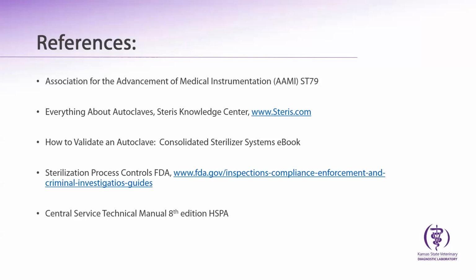And if you're doing glassware where you're just covering it with foil and using one of these, basically bending it over to hook on there, and then putting your foil on top with a piece of autoclave tape, I have seen it adhere to the outside of the glassware. So then you have a product that's not usable.